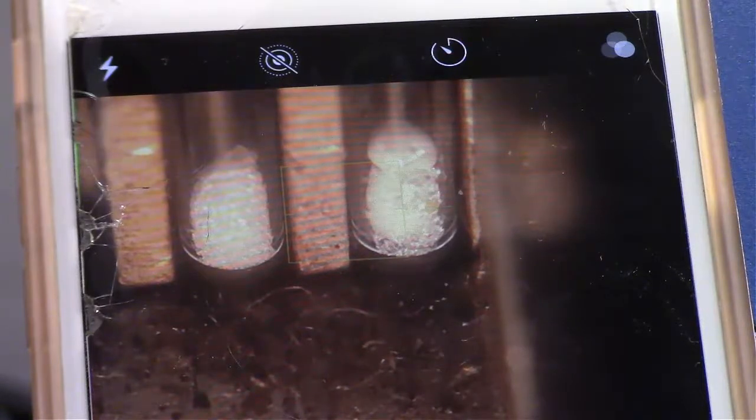And you can start to see a little bit more distinction between the actual paper and the crystals for the sample on the right. So the crystals are a little bit more transparent. They almost look like ice sitting on the outside of the paper, but again, we still have not yet started to melt.